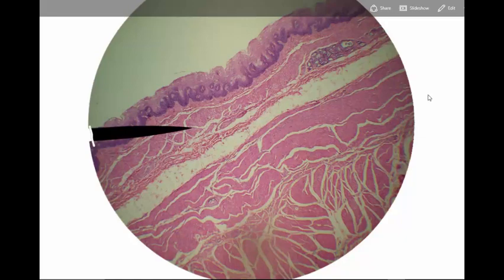For this slide, questions that I might ask, what organ does this section come from? And the answer to that question is, this is esophagus. How about, let's name the layer at the pointer. And the layer at the pointer, we're referring to the layer of the alimentary canal and that pointer happens to be in the submucosa.